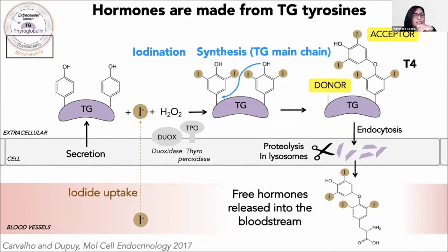Sorry, how do you get the tyrosine off your storage tyrosine? How do you get the iodine off your storage tyrosine? Yes, that's an excellent question. Sorry, I didn't include all the cycle.